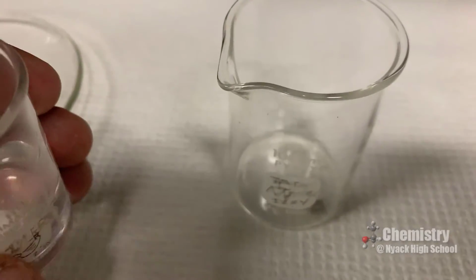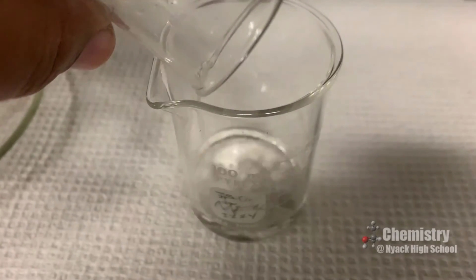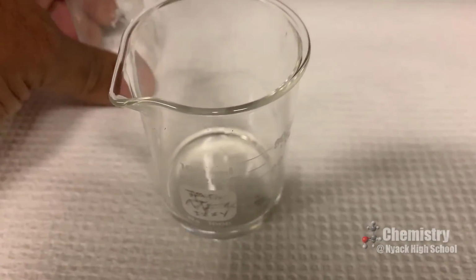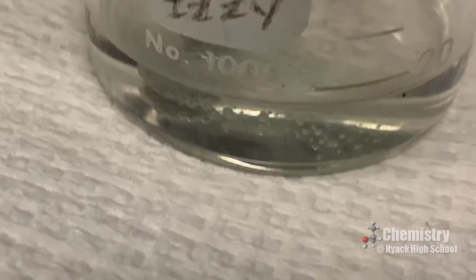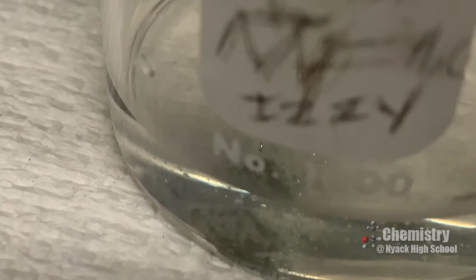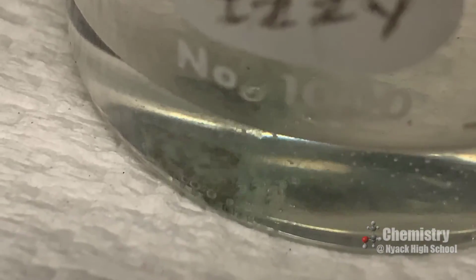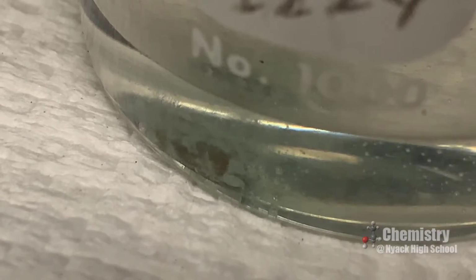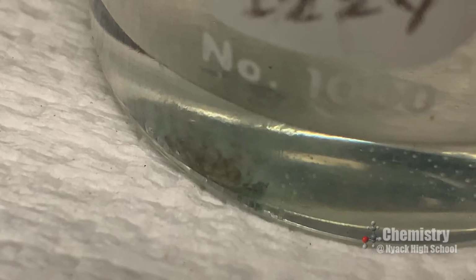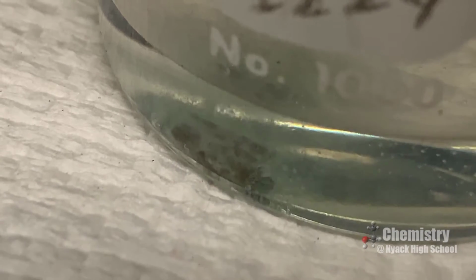I'm performing this procedure in the fume hood. You may be able to see the coin fragment dissolving. This process will take some time. I will check back in a few minutes.